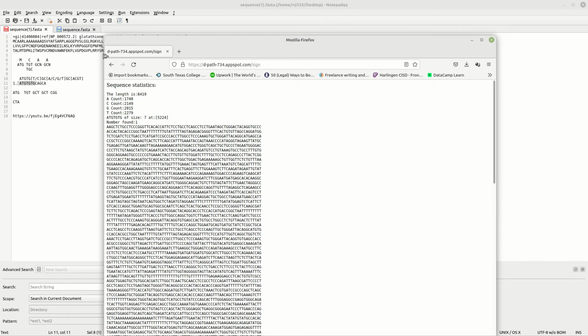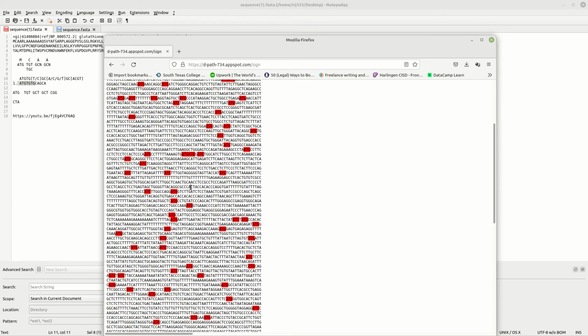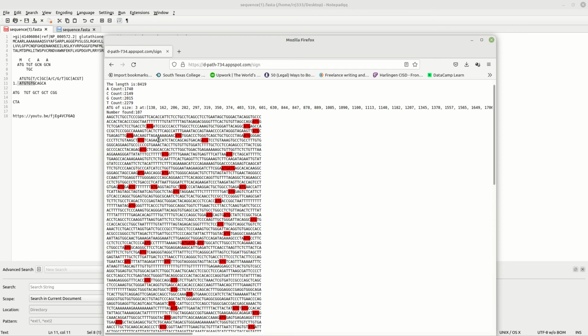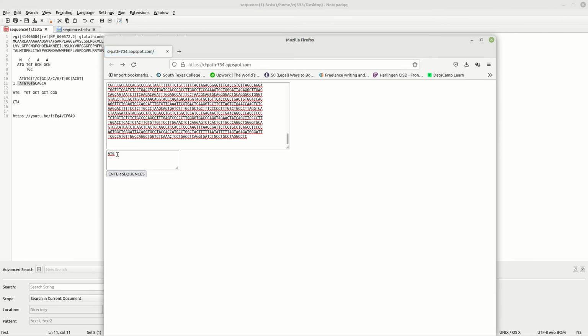Now, just for fun, let's go look and see how many just ATGs there were. As you can see, there are lots of ATGs, and they're kind of evenly displaced. There's an interesting one there. But essentially, that doesn't tell you anything. There are too many of those. Let's see how many if I go ATG, and then we add just a T from the next one. See how many that reduces it from, just for fun here, so you can get a feel for how this works.